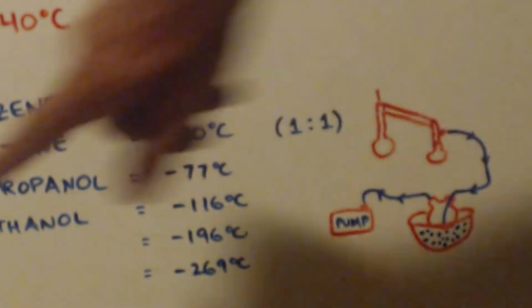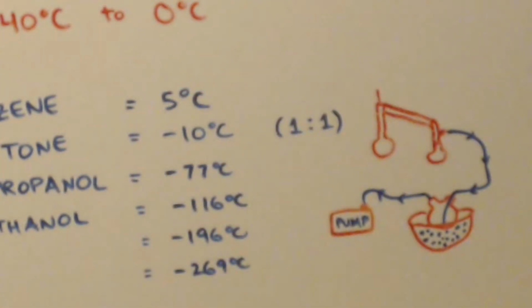So you're going to use CO2, dry ice, and isopropanol. You may need it to be exactly 5C, or somewhere between 0 Celsius and 10 Celsius. So you're going to use dry ice and benzene. You'll keep a constant temperature of 5 degrees Celsius.